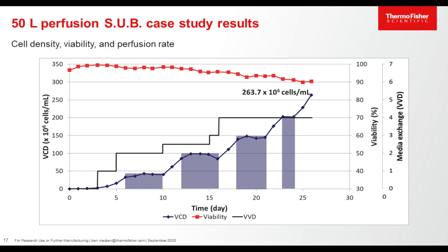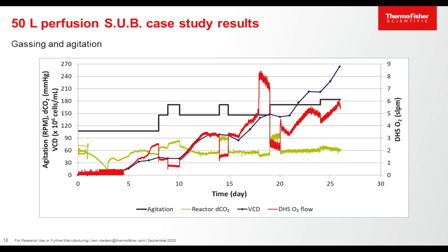All this was done while maintaining viability above 90%, even at these extreme cell densities and packed cell volumes up to 40%, and gas flow rates and agitation rates that we'll go over in the next couple of slides.